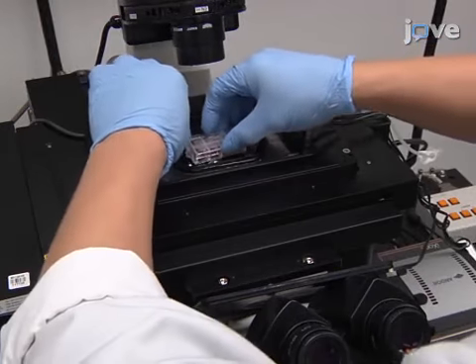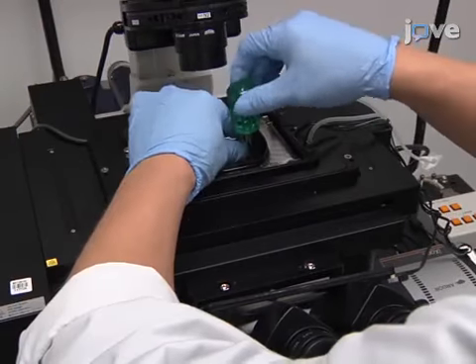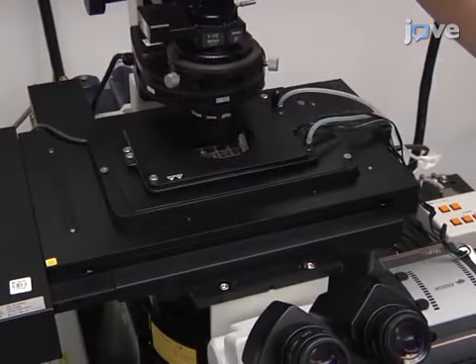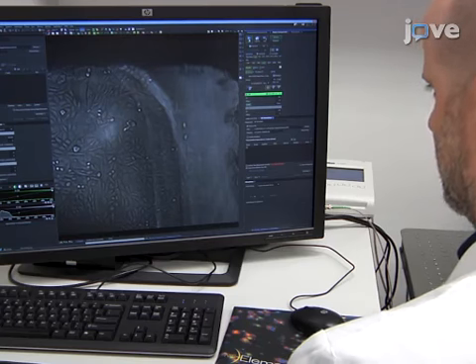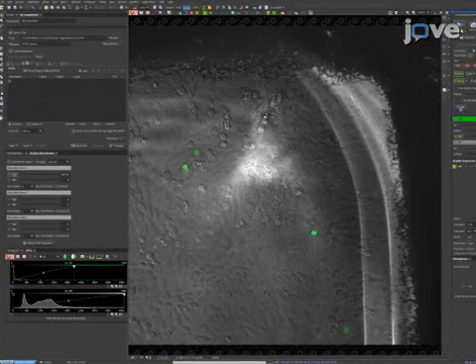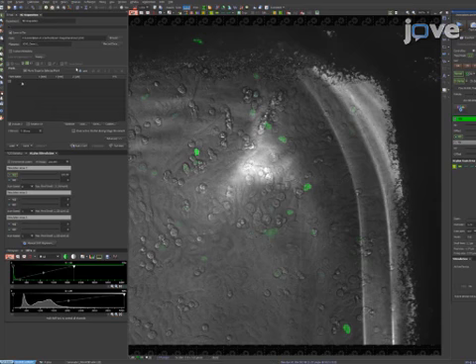Begin this procedure by placing a chambered slide containing the cells of interest in a stage-top incubator maintained at 37 degrees Celsius and 5% carbon dioxide. Register image fields using an encoded automated microscope stage. Select a recognizable feature of the culture vessel, such as the barrier between wells, collect an image, and record the XY location. This will allow for alignment and registration of the XY locations of selected fields following sample preparation.